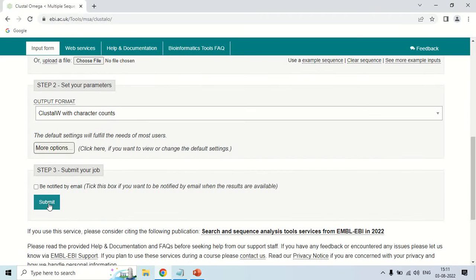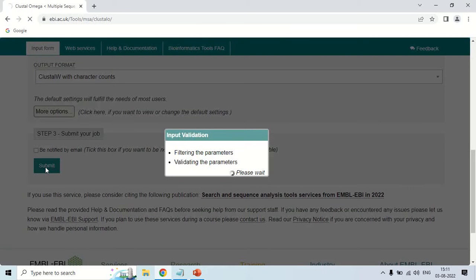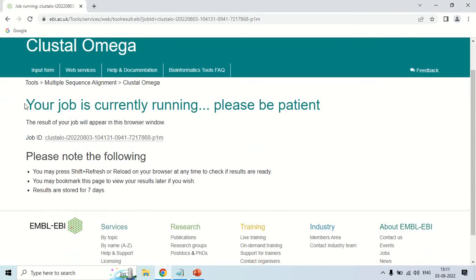Now just click the Submit button. There is one more point: if you tick this checkbox, the result information will be emailed to you — it is up to you whether to check it or leave it as is. As you click the Submit button, your sequences are now under processing. You can see the statement here: 'Your job is currently running, please be patient.' This means the software is now performing the multiple sequence alignment.